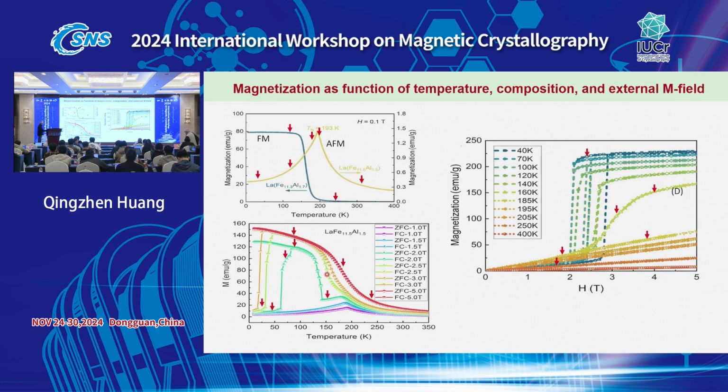In those cases, you also need data at each transition, above and below. Therefore you can get the full transition pattern of the magnetic structure.